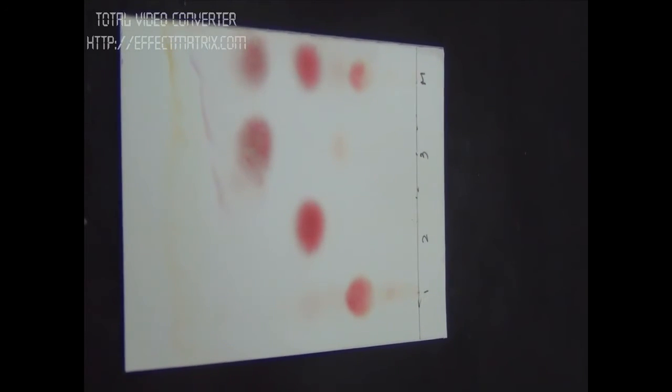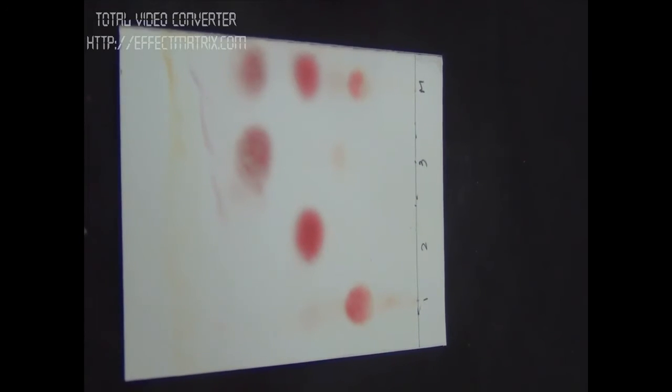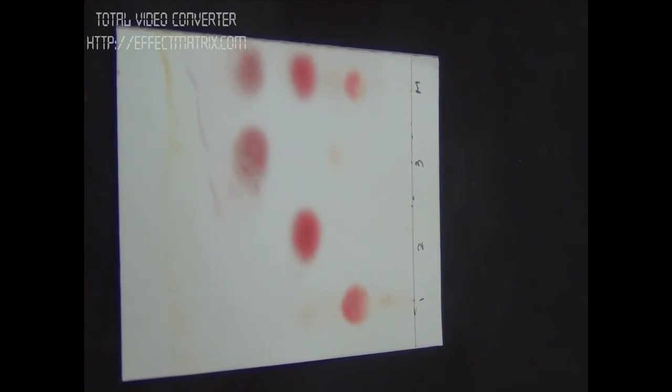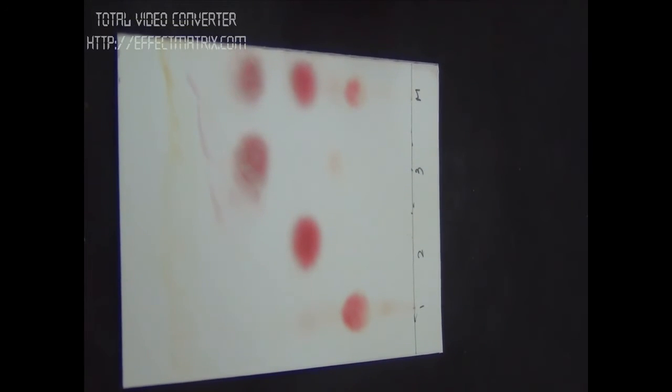Now the TLC plate is ready. We have sprayed ninhydrin. After spraying, we have kept the plate in hot air oven at 81 degrees.